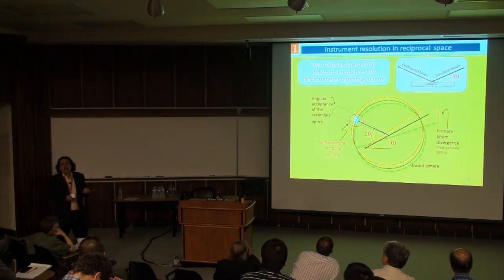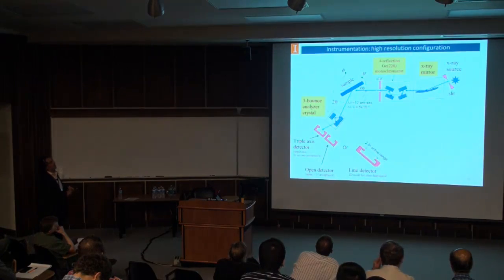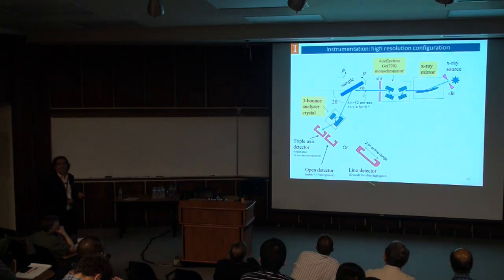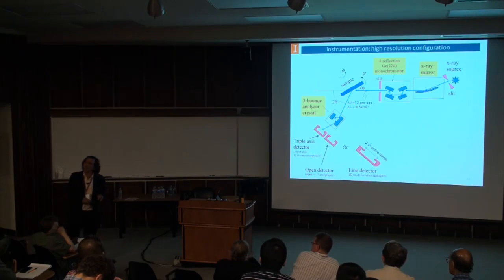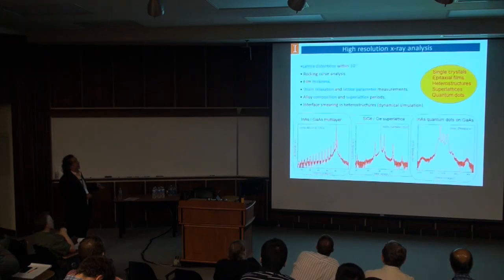So all the high resolution instruments work in this way: they make the beam very narrow angularly, either coming in towards the sample or out of the sample. That's the key, using multi-reflection crystals. So when the beam comes out, it is behaving very nicely, very parallel. We are talking about a difference of like 0.003 of a degree versus a tenth of a degree.